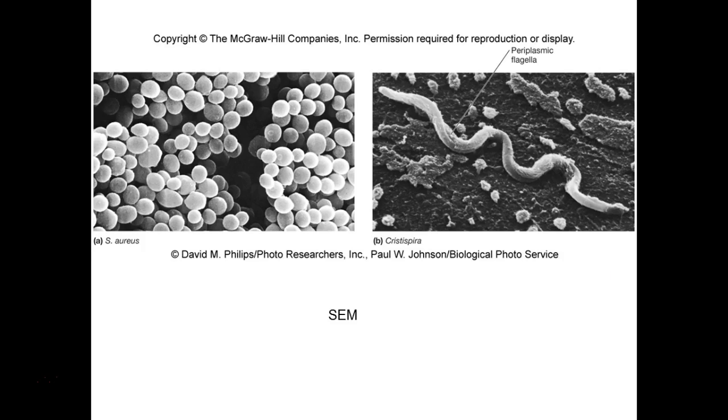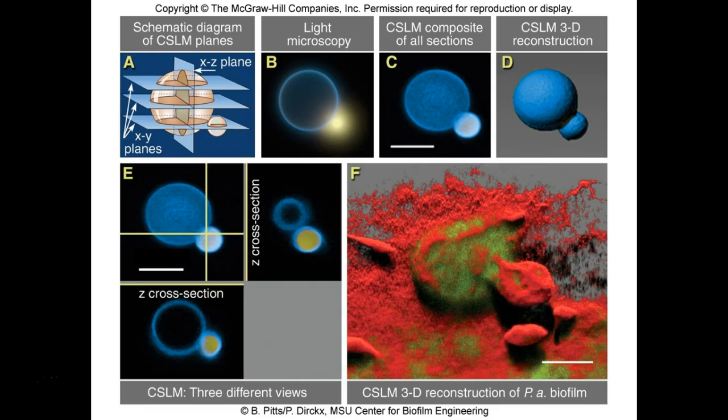In prepping these organisms for electron microscopy, trust me, they're not alive anymore. You don't see stuff moving. It can't move with electrons. We can't get an image if it's always moving. So it's fixed, it's dead. It's not going to be alive again. And it has to be prepared in a special way. So this is the one that has its own special room at LSU. This is the laser scanning microscope, where again, it's using lasers. And so we can create multiple different images on the computer screen. And you can even use special dyes to be able to see different parts.